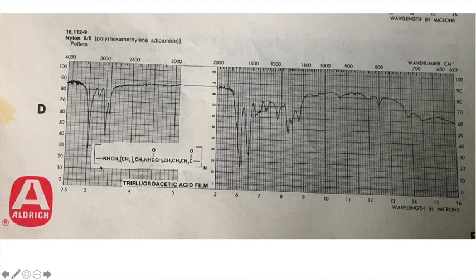And then I went back to my IR spectrum book to see if I can find nylon in there to compare it to the nylon IR I took. And yep, there's some nylons here. We got nylon 6/6. That's the one we're going to use, on page 1590, spectrum D. But they also have nylon 6/9 and nylon 6/10. There's different nylons, but okay. So here's our nylon 6/6 that we want to compare ours to. At first glance, it looks pretty similar.